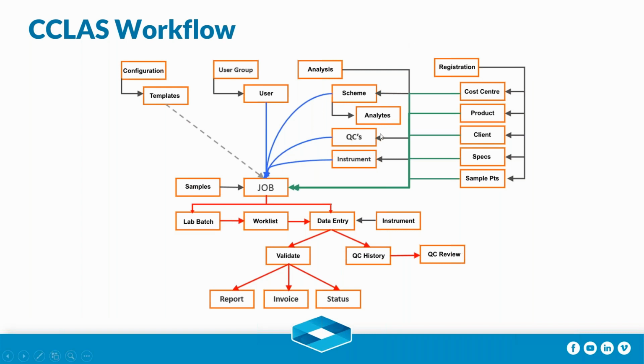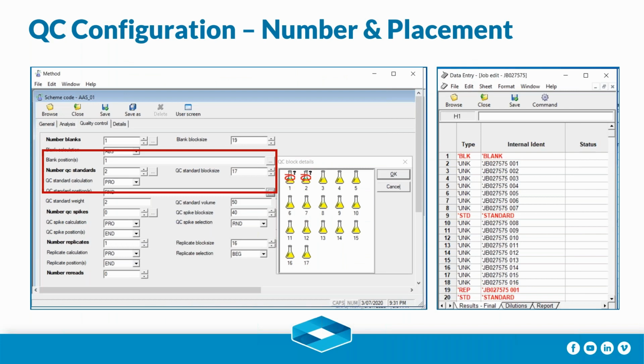Today, we're going to look at the QC module, setting it up, the configuration. And then later on, we will show you how we use the QC module to evaluate our test work. Right, when it comes to configuring our QC samples, we have some fundamental concepts here. One is called the QC type, in which we configure the number of QC samples and the placement.